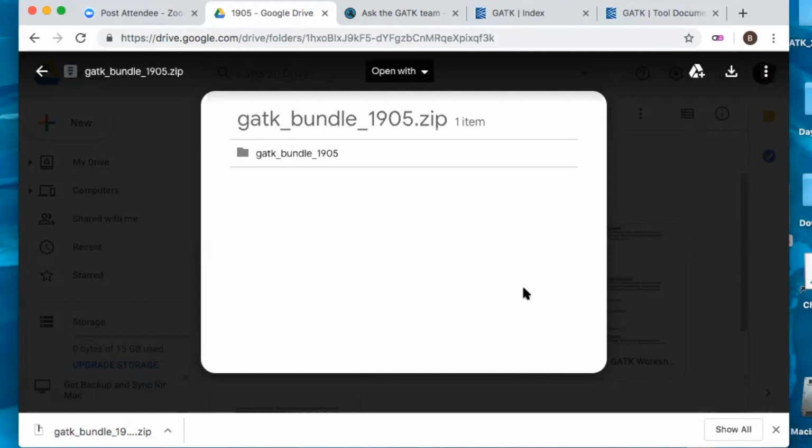How do you find your downloads on this? Or from the home, I think you should be able to go home. And there's no downloads there? Interesting.